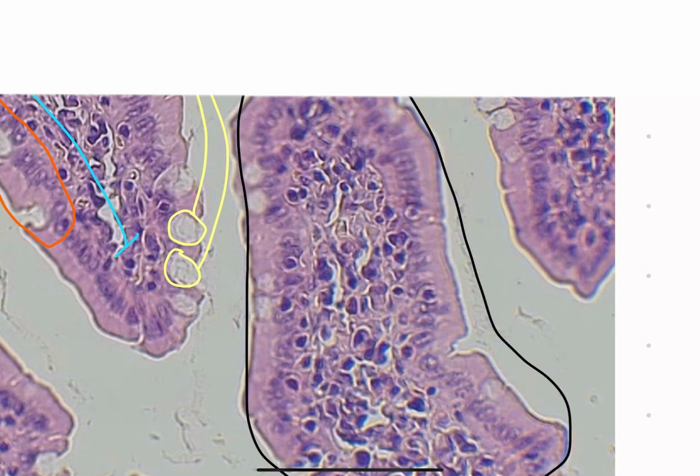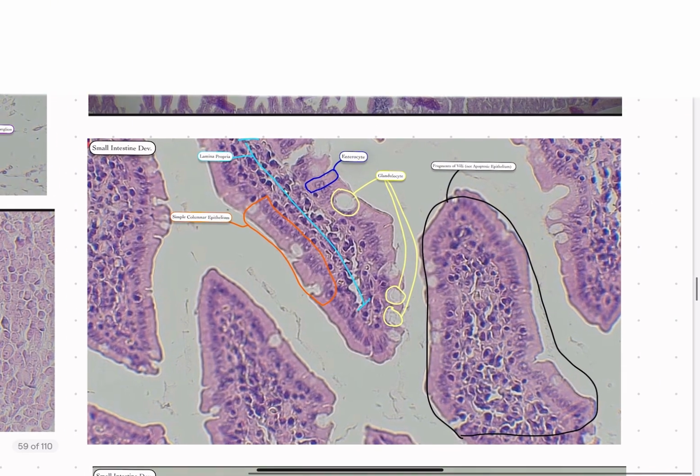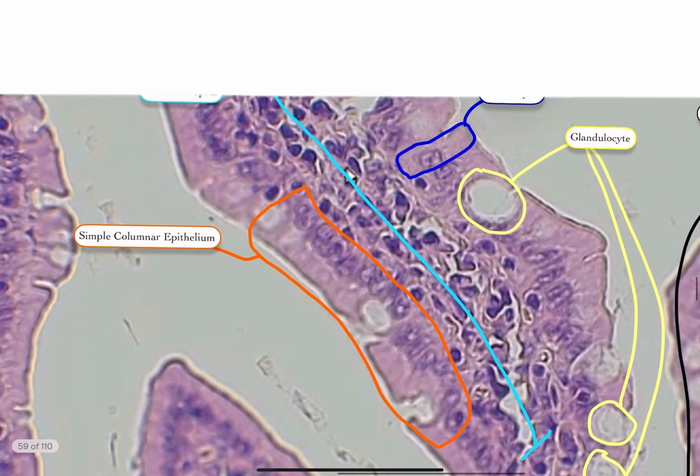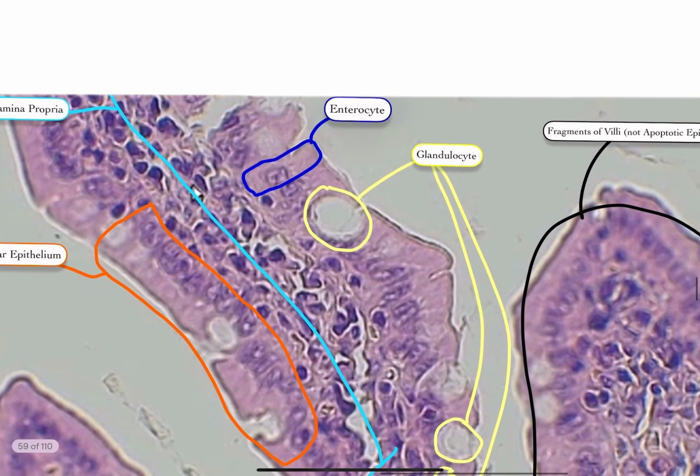They are just cut very differently, so they're cut like this instead. And there are two types of cells that line it. The first one is the enterocytes, which are the most abundant cells. There are these simple columnar cells that help with the food uptake. We can see it here. And then a row of those cells is simply just called the simple columnar epithelium.